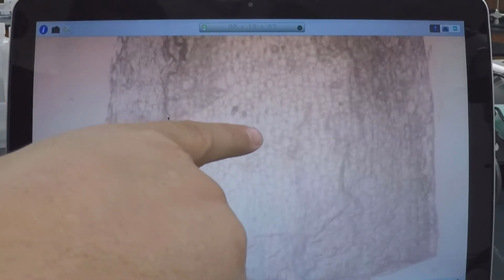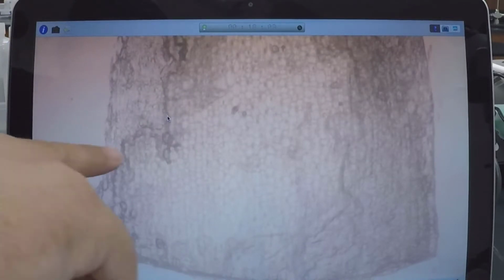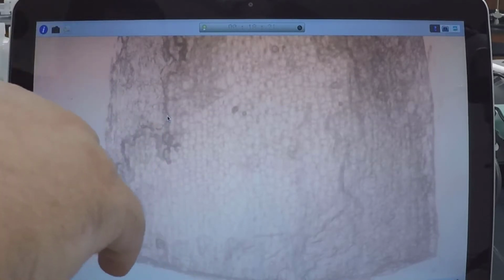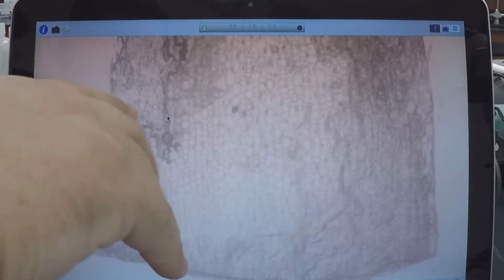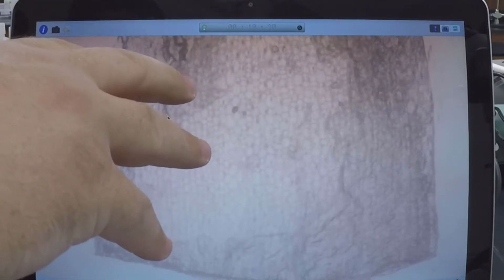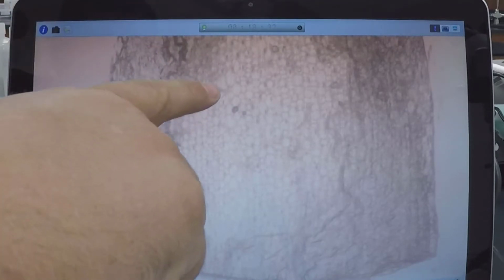And you'll see what I'm talking about when I get to the edge and I show you the actual rectangular shape of plant cells. Okay, that rectangular line is the plant cell wall, and I'll point it out in a second. But again, this is what Robert Hooke was looking at when he described, well, not onion, but cork, which is just the inside layer of bark, when he described cells to begin with. So cells were described via the rectangular shape that they possess, if we're talking about plants.